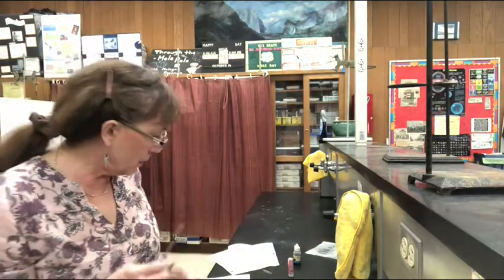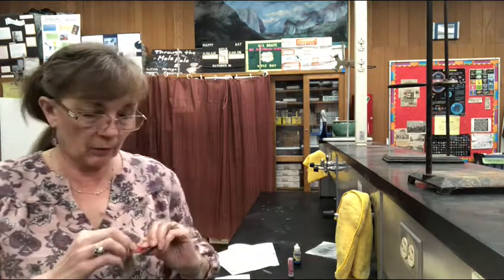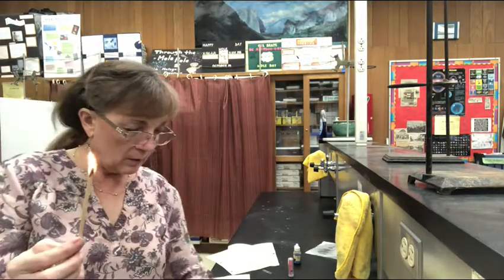So I already told you, but when we're testing, we're making water and oxygen. So this time we're going to use what's called a glowing splint to test for the presence, if our prediction's correct, that we made oxygen gas. And sometimes I get lucky with this and sometimes I don't. I'm not going to hold my breath, but here's my lit splint.